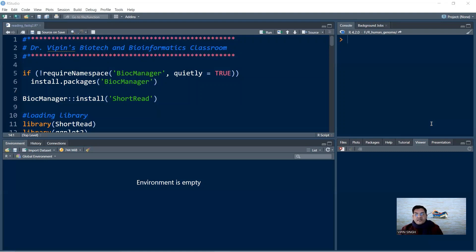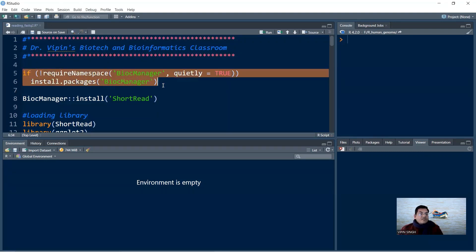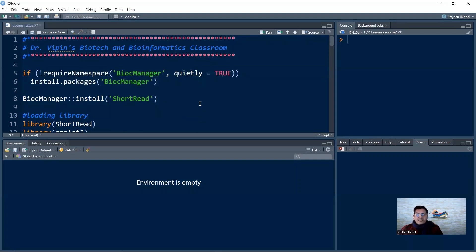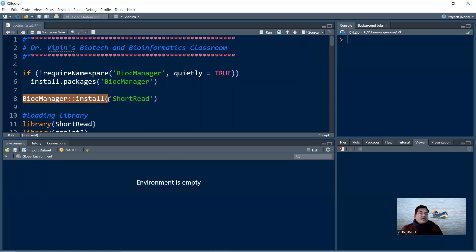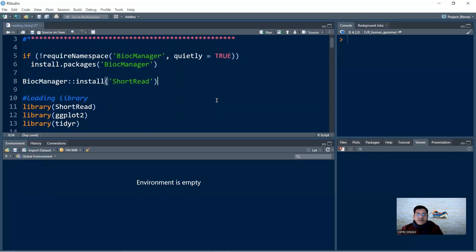Since the ShortRead library is part of the Bioconductor suite, you first need to install the Bioconductor Manager, or BiocManager. These two lines of code allow you to install BiocManager into your R environment — it will check whether BiocManager is present, and if not, install it. Once BiocManager is installed, Bioconductor packages can be installed using it. The command is BiocManager::install(), and within single quotes you mention the library name — in this case, ShortRead.